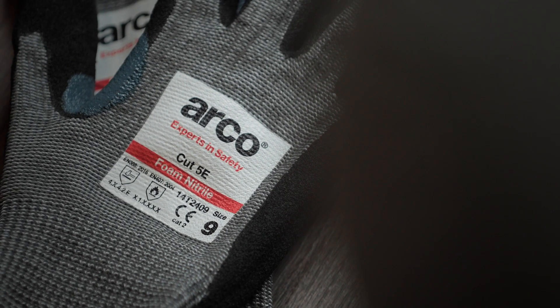We recommend that this EN ISO 13997 result is always used when selecting gloves for medium or high cut risk environments.